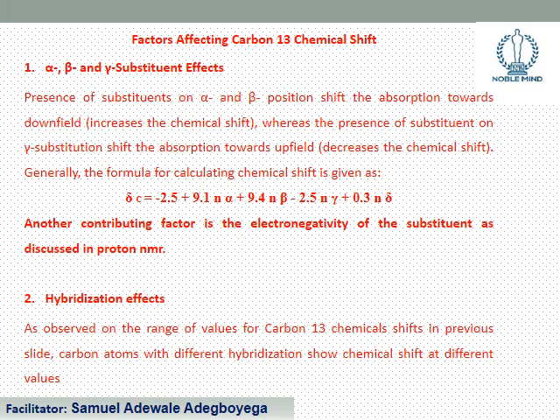So if you are considering a particular carbon, place your cursor on that carbon. That's carbon number 1. The carbon next to it, which you could call number 2, is referred to as the alpha carbon. The one that you could call number 3 becomes beta.